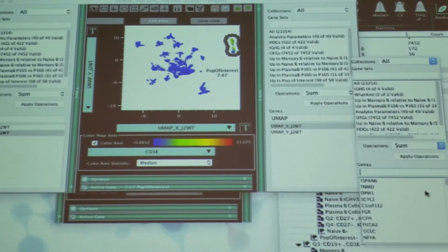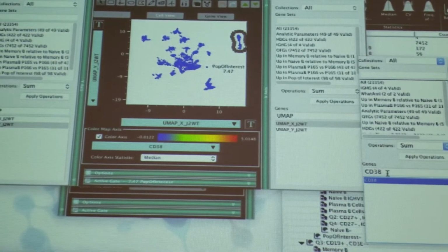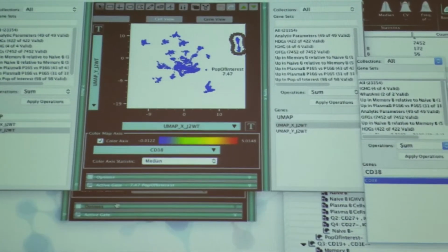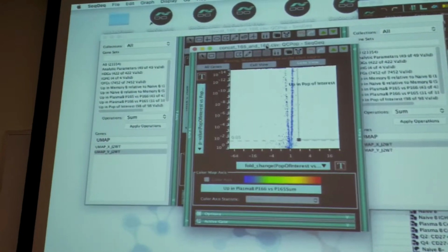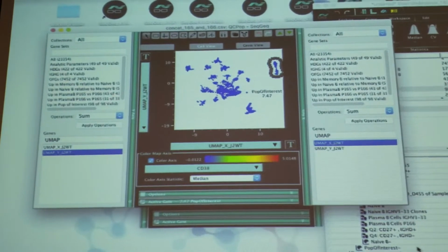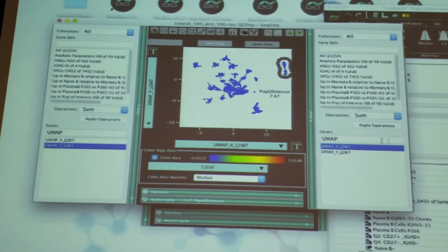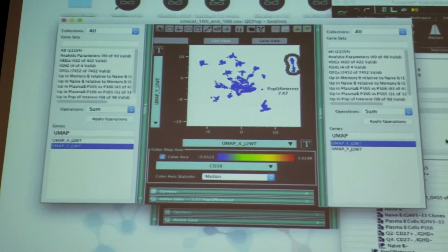Yeah. Huh. That's interesting though, because I thought we defined the CD19 positive versus negative. We definitely did. Let's see. Yeah, so my question is, how do you even set the positive versus negative in that gate?